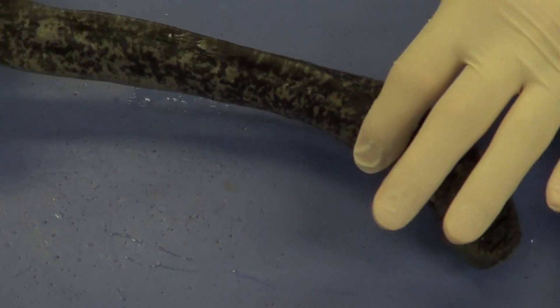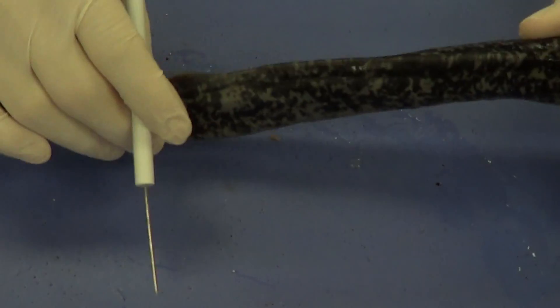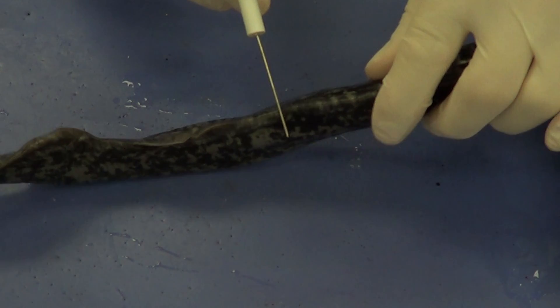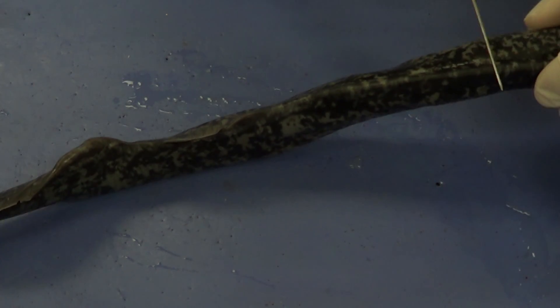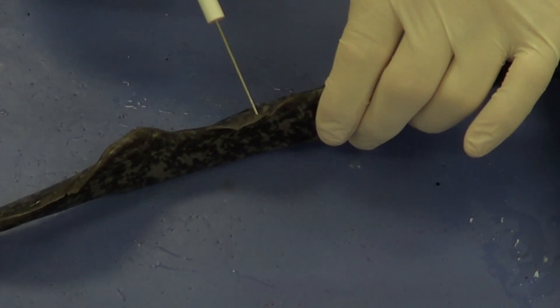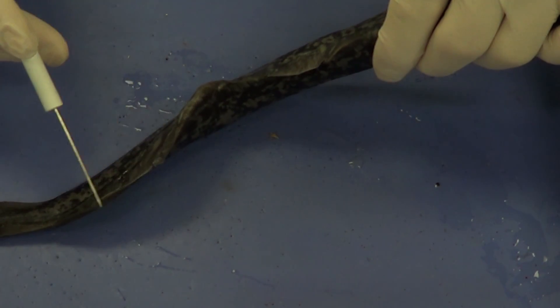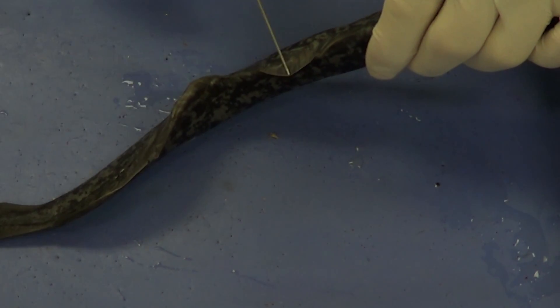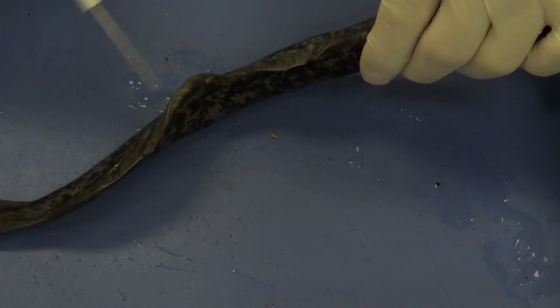If we go on a little bit further, we can see what's beginning to form here is going to be the dorsal fin. The lamprey only has a single fin all the way down its back, which is most noticeable here — we're going to call this the anterior dorsal fin, and this is going to be the posterior dorsal fin right here. Anterior because it's more headward, and posterior because it's more tailward.